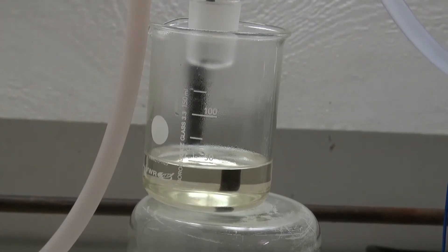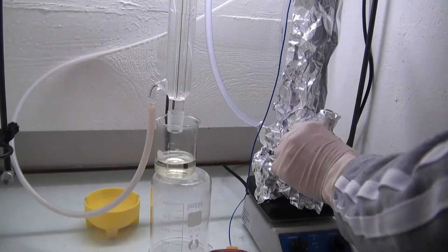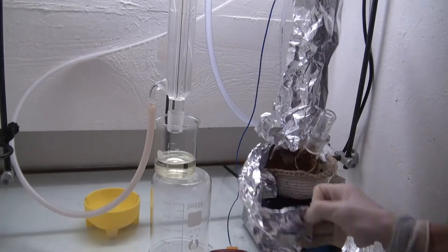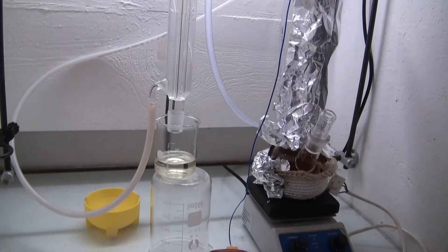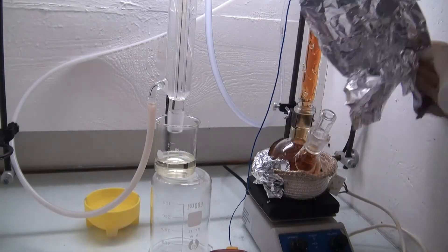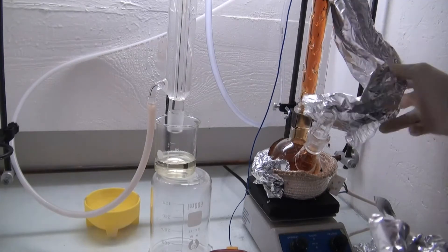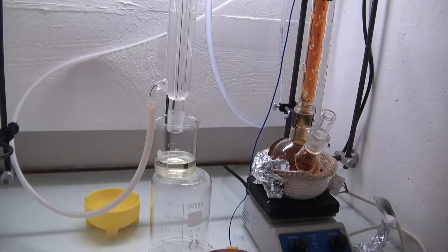Four hours later the distillation was stopped and the aluminum foil was removed. This uncovered that both the flask and the fractionating column were filled with nitrogen dioxide.